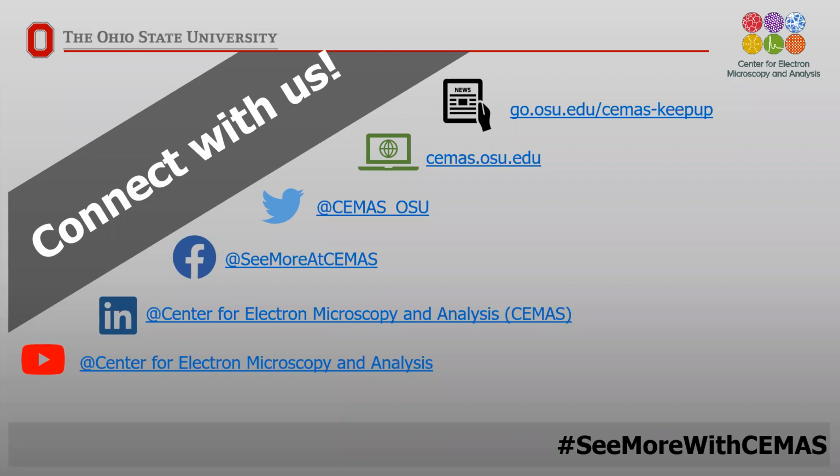There are some systems, I believe, out at the National Center that can go hundreds of frames per second, but they have a direct pipeline over to the supercomputer center to swallow this torrent of data that's coming through. You know, you're getting terabytes per minute of data coming through the system. So it's a data handling problem as much as anything else. Okay. Thank you.